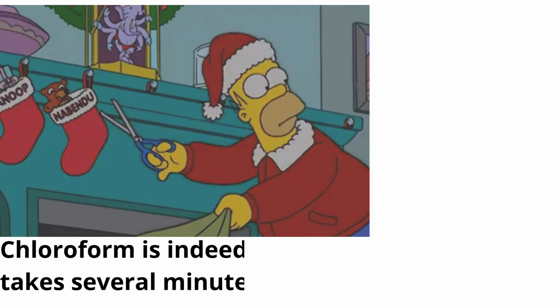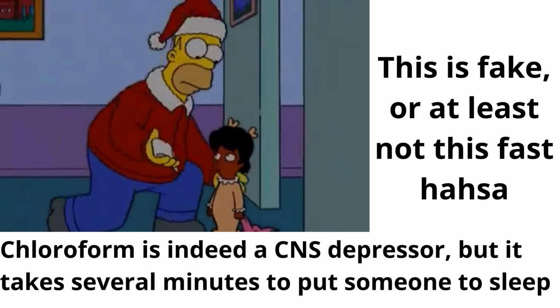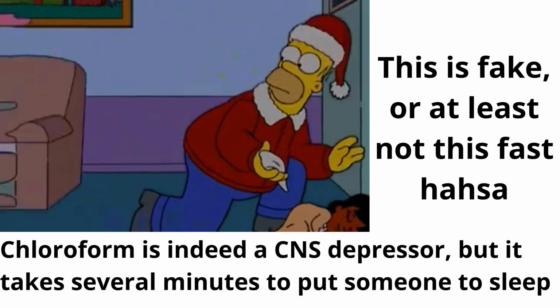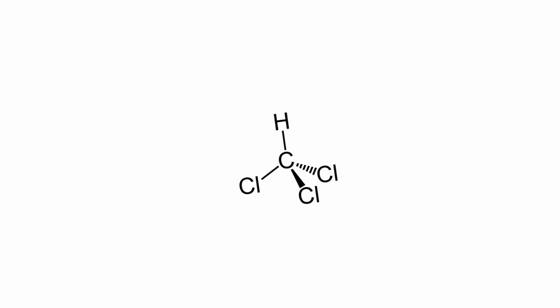Chloroform is a very famous central nervous system depressant, and because of that it is often associated with kidnappings and things like that. The reality is that it is not that effective, because you should expose the person for several minutes. Not advice. As I said, chloroform could be used as a useful reagent in organic synthesis.